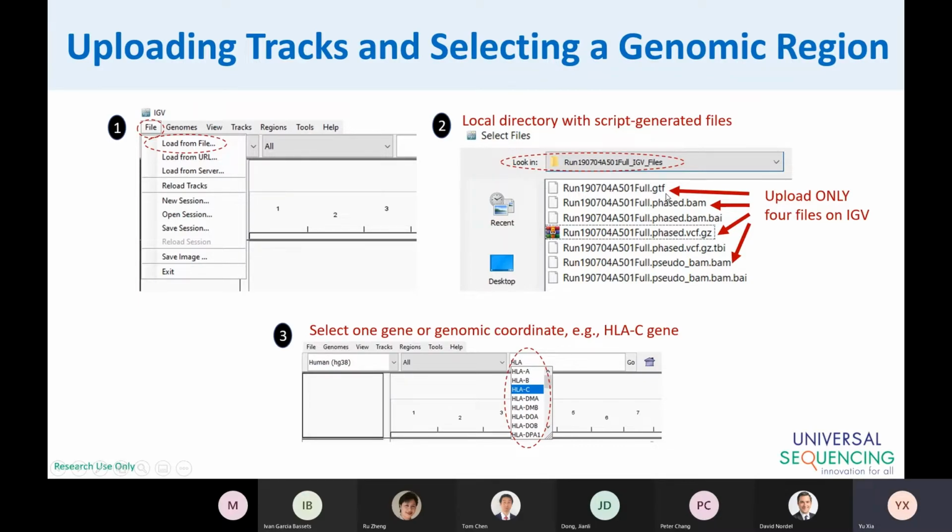In this track, there are multiple view options that IGV allows, which are very informative. People may want all the reads belonging to haplotype 1 grouped together and aligned to the reference genome, and the same for haplotype 2, and also the unphased reads.